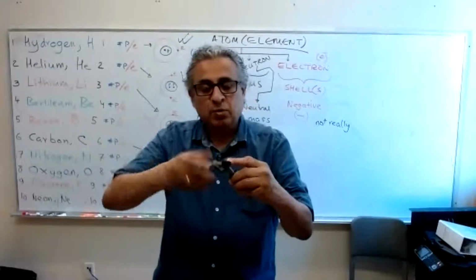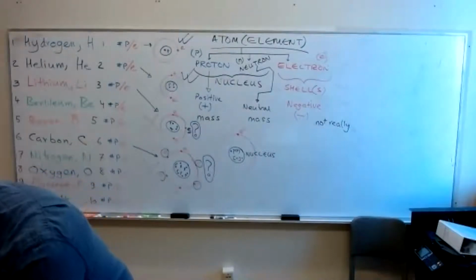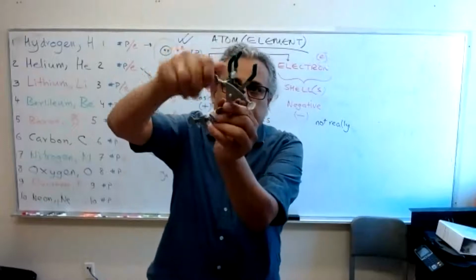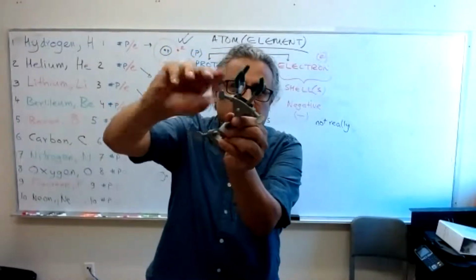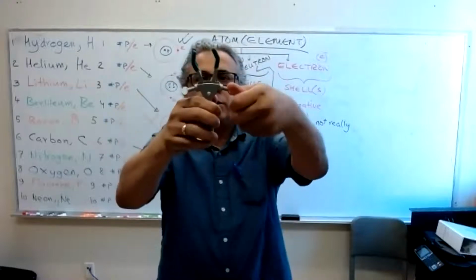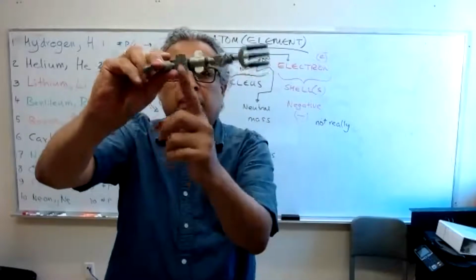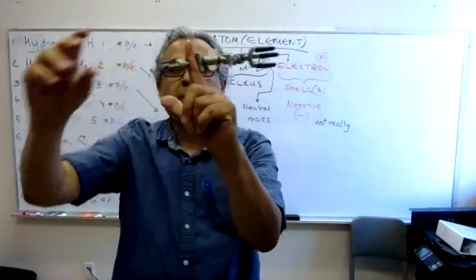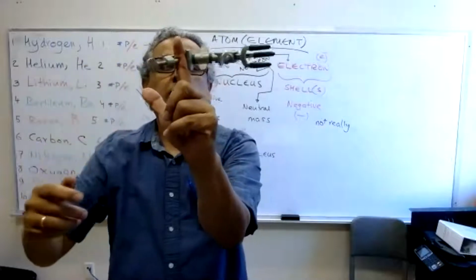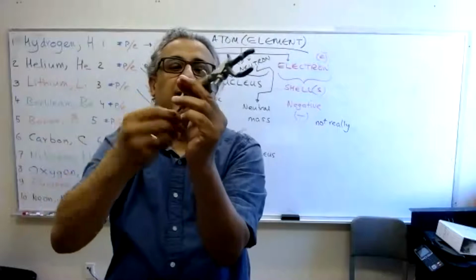Okay, so this is one kind of clamp. This is a 3-prong clamp. Okay, if you turn it, it moves this way. Turn the screw, you open it up. Again, this screw turns the other end. This is where you attach it to the monkey bar. Okay, imagine this is the monkey bar. You attach it here. I'm not going to break my finger. Okay, and then you can adjust it by turning that little thing.